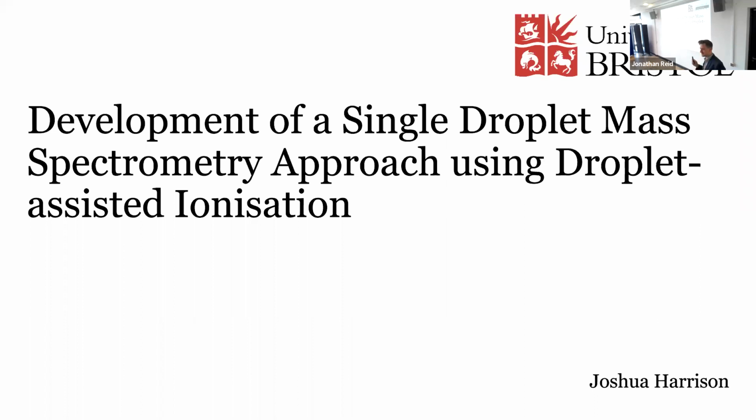My PhD has been a bit chaotic. I've been working on different things, but over the past few months, I've been working on the development of a single droplet mass spectrometer approach using droplet assisted ionization, which I'll now refer to as DAI. But actually, I'm going to just talk about plume droplet mass spectrometry instead, and then talk about the future work later on as well.